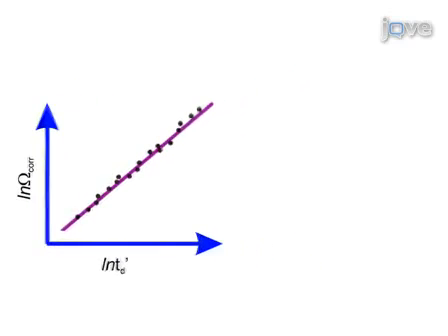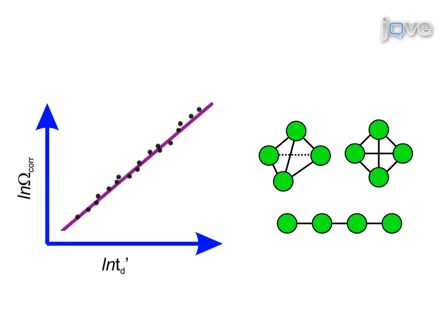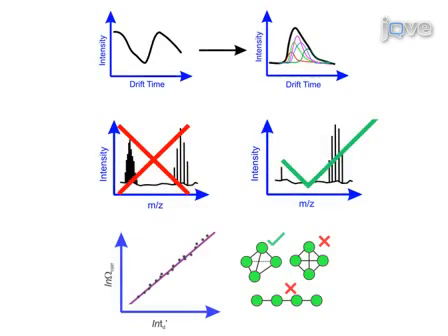Next, the measured drift time values are correlated with cross-sectional areas. Results determine the collision cross-section values of proteins or protein complexes with unknown three-dimensional structures. This information provides clues on their overall shape, subunit packing, and topology.